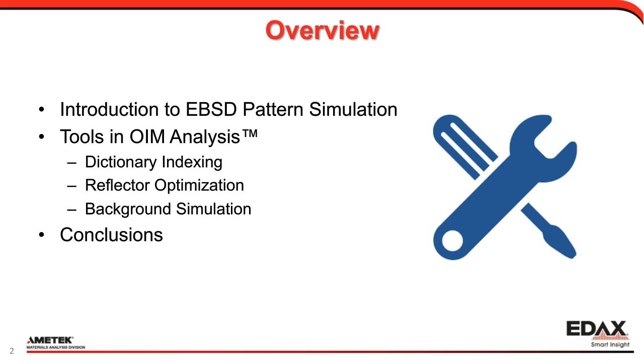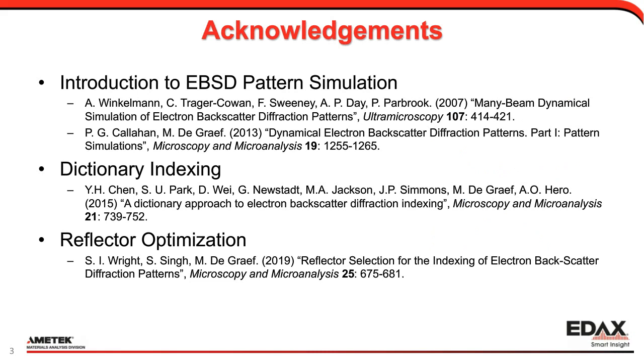Before I get started, I want to make sure that I acknowledge several folks. While the dynamic pattern simulation is not my work, it's the work of others who have done some terrific stuff to get us started in this arena. Most notably, Aimo Winkelmann, who, while at the Max Planck Institute in Halle, developed dynamic pattern simulation that gave simulations that really started to look like experimental patterns. And also following up, Marc De Graef's work at Carnegie Mellon University, who has also continued in that vein with a slightly different approach.